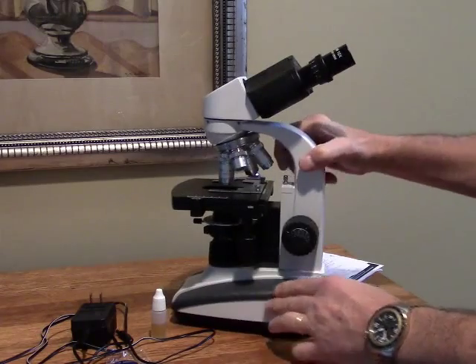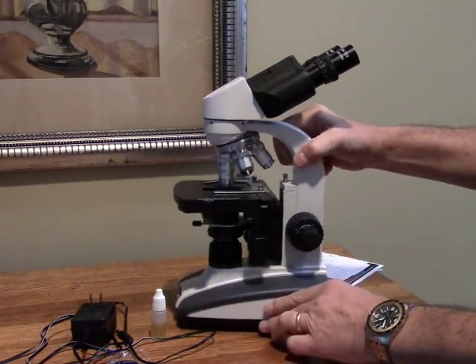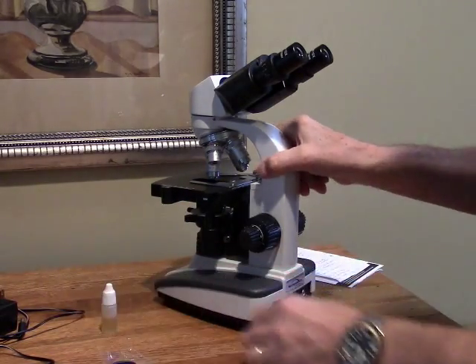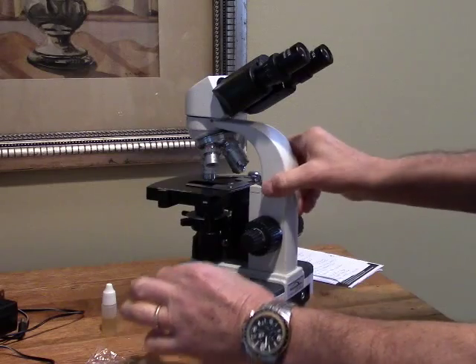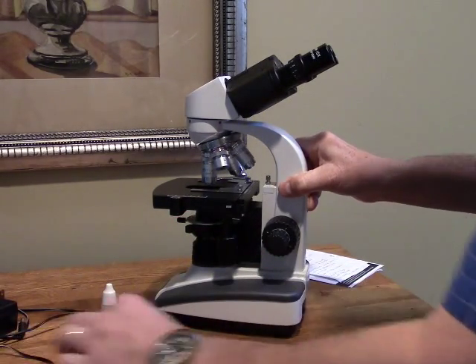The reason there's a battery in this microscope is it has a rechargeable LED light for the illumination, and I'll talk more about that in a moment. You also get a small bottle of immersion oil for the 100x objective lens, and finally you get a blue filter which you can put right over the light, and also a little hex wrench.